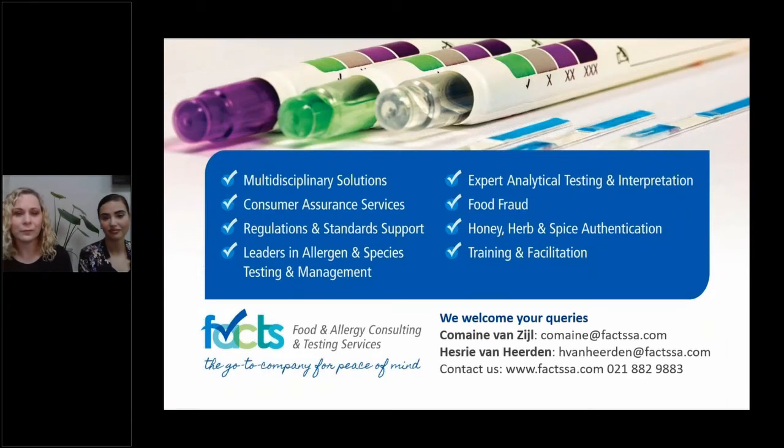Are there any legal requirements regarding the kits? No. The only legal requirement is that you need to prevent cross-contamination. You need to do risk assessments, and the only real mention of testing in the regulations pertains to gluten testing, where the method is prescribed. So no, there's no legal requirement to do any verification testing. It all forms part of the allergen control plan and showing your due diligence, because allergen rapid kits and testing are at the end of the day there to show due diligence for the controls you have in place. So indirectly, but not directly mentioned.